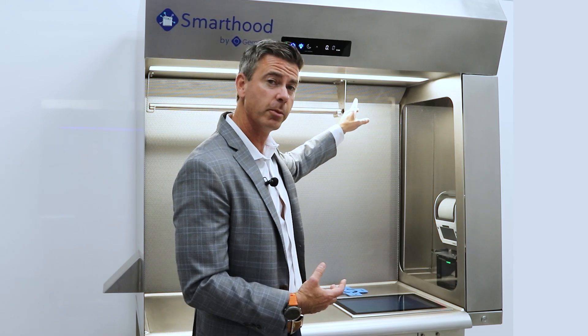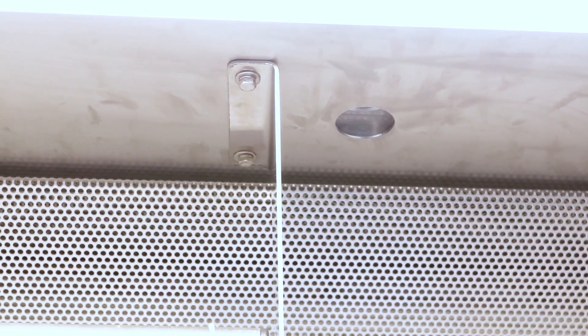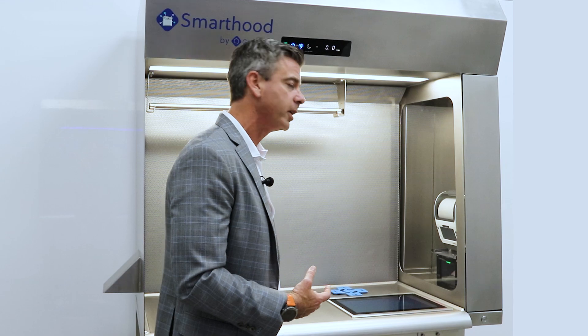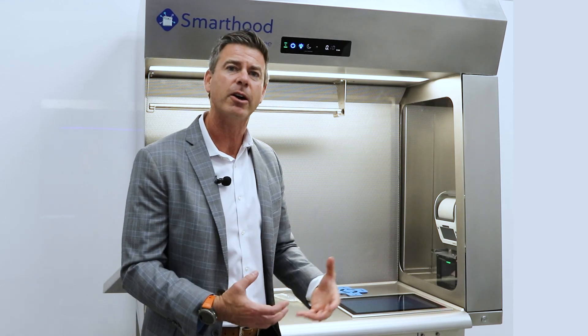Next, we actually have two cameras integrated into the unit. The first one is going to be aiming down at the preparation to capture the final preps. And the other is going to be a complete field of view camera to allow you to get that complete field of view image.